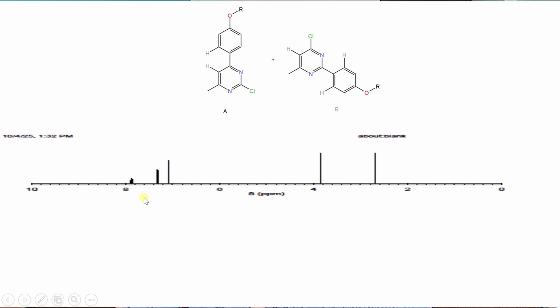These all belong to the aromatic region, because 7 to 8 is the aromatic region. Here you can see these aromatic protons belong to this region. So this clears that these 5 protons are here. But the problem here is that both of them will show similar kinds of peaks. These 2 protons here and these 2 protons here will show the similar type of peak, right?